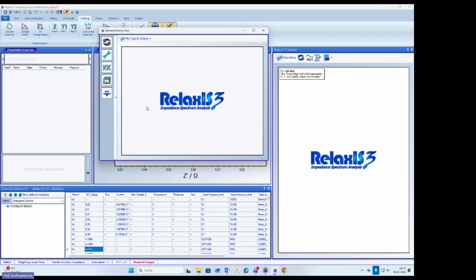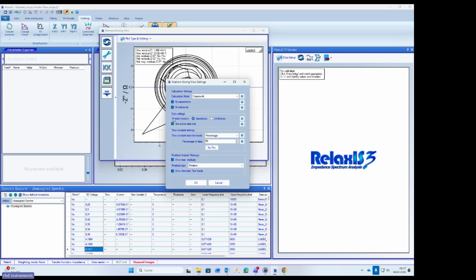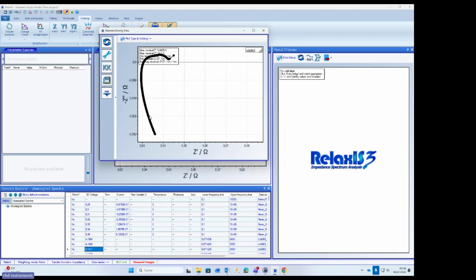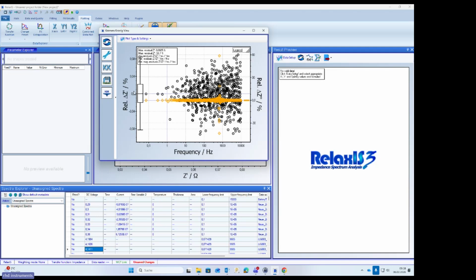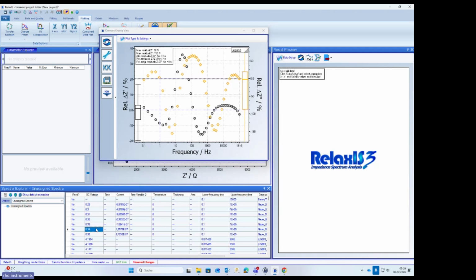Here, in Kramers-Kronig view, you see, select here. For this battery data set, I have to minimize the number of time constants because otherwise we get some overfitting, what you see in the background for Kramers-Kronig. And if I limit this, because we have here more than 700 data points, you get then the Kramers-Kronig plot as it should look like. And we can also depict the residual plot, for instance, the relative residuals.